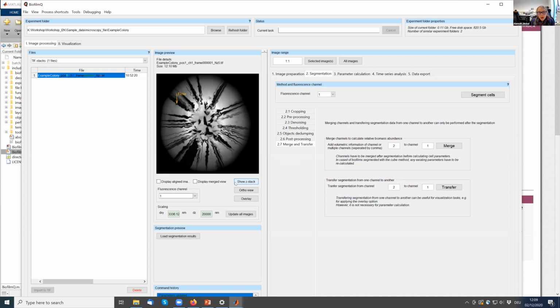So every cube will have some form of ratio between these two different colors. And this ratio translates to an abundance in the cube that tells us how the two strains kind of compete with each other.